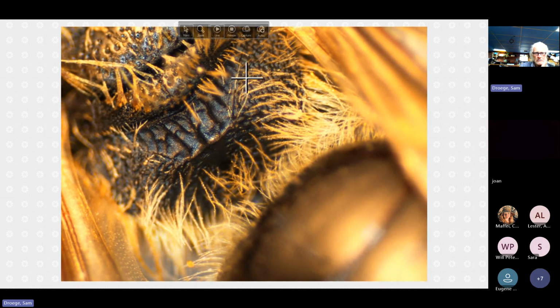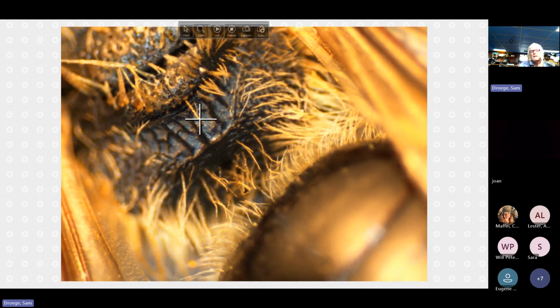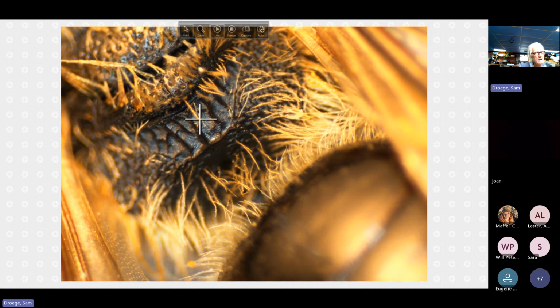This is clearly a lot denser and finer in its granularity than this, and this has quite large, bold things. So it doesn't look like the other one; it's not just something painted brown, not red. So it's good to leave it as a question mark in this particular case, because it does look like something different. And these are the kinds of things that everyone pulls their hair out over.